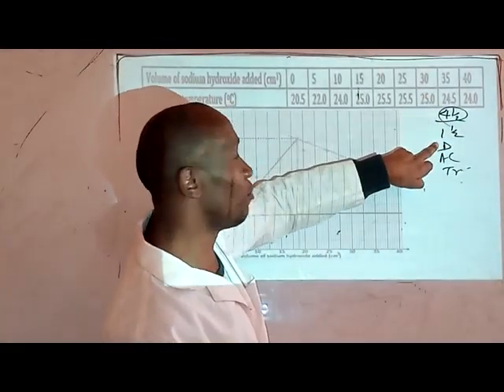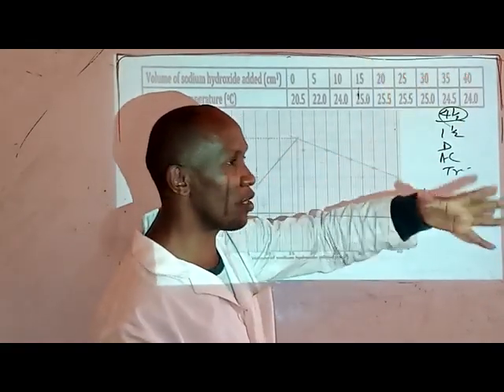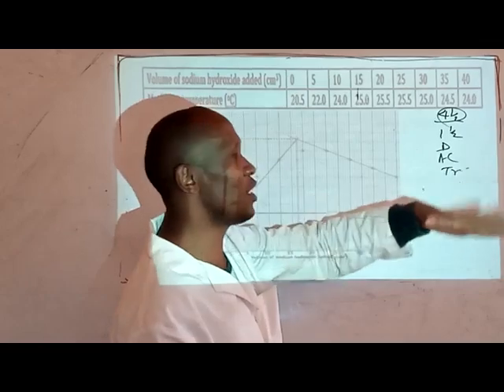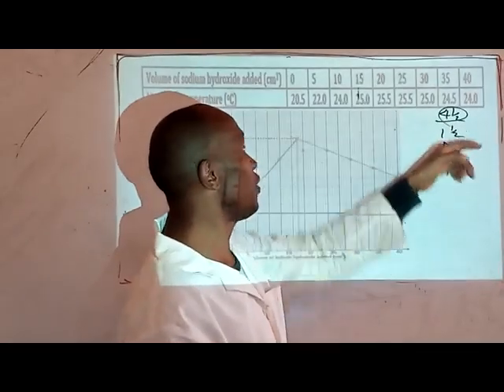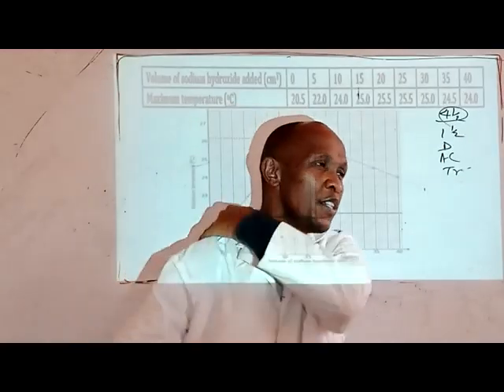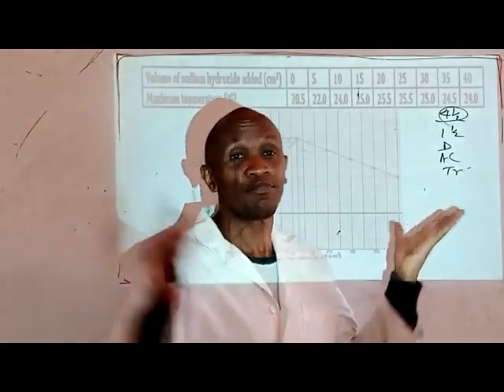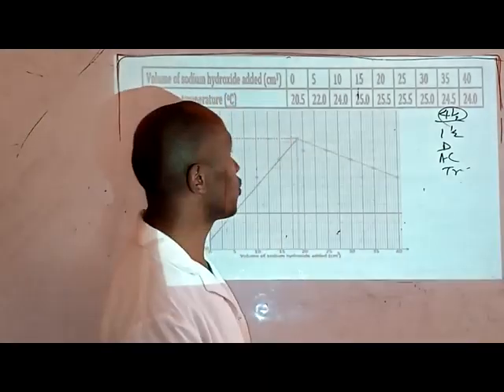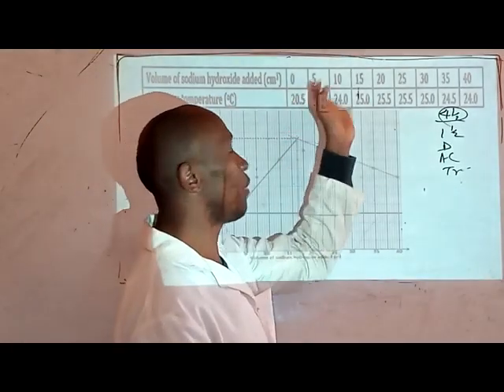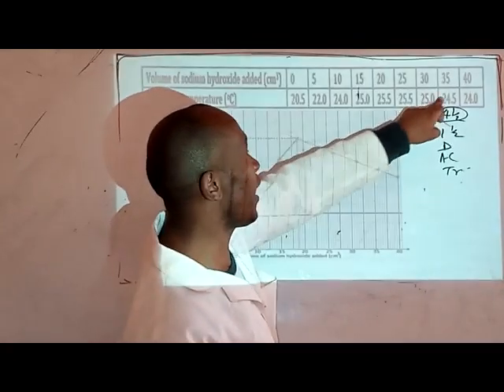So the decimal mark: whole number or one decimal, consistent, never two decimals. Then accuracy, this is a value, not that we are very afraid here. We are going for the value that is easiest to get, so plus or minus 2. Now the trend, that is where I changed.